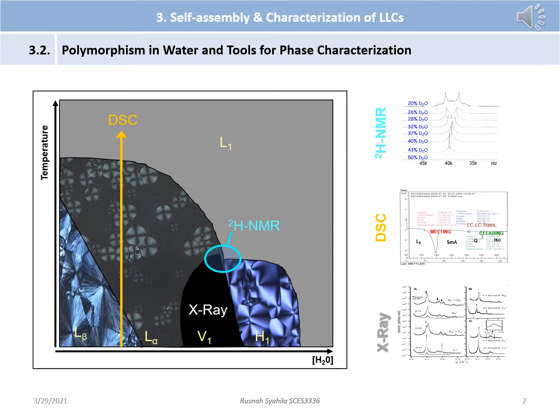The diagrams on the right side. The top diagram is the spectra based on deuterium nuclear magnetic resonance, NMR, analysis. We will observe peaks, unlike proton or carbon spectra that you are familiar with. The diagram in the middle is the thermogram from differential scanning calorimetry, DSC, analysis. The diagram on the bottom is an example of X-ray analysis. And the picture on the left side with textures is the phase identification based on optical polarizing microscope, OPM.